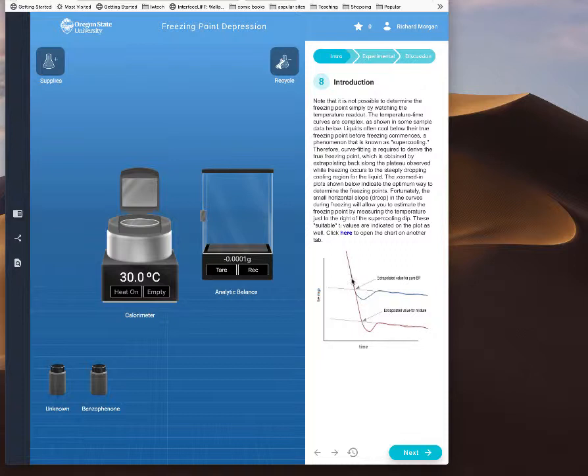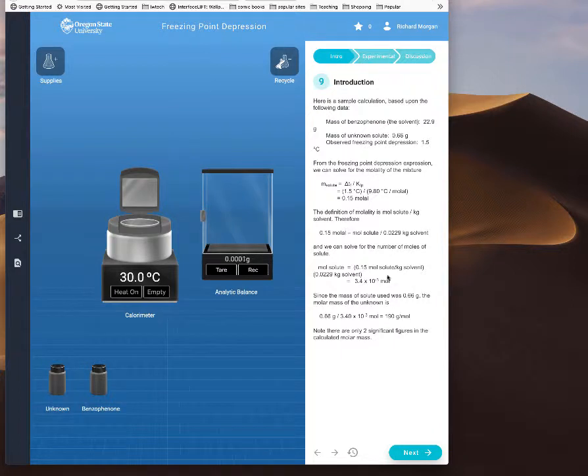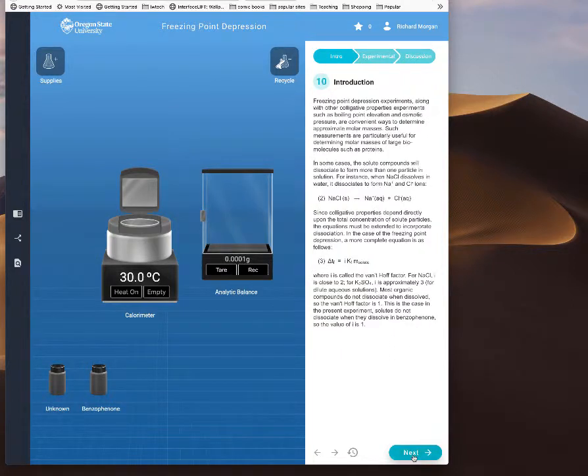It also talks about supercooling here, because it gets a little cooler before the crystals start forming, just because the solution is still coming to equilibrium, and so this can tell you where the actual point is. They say you can extrapolate there, but we don't do that. We're just going to measure it, like right here, which is slightly lower than the number you should probably get, but it's a good guesstimate. So anyway, there's your example stuff.